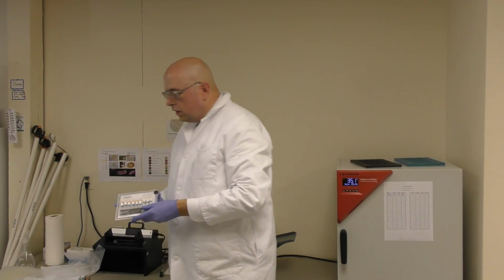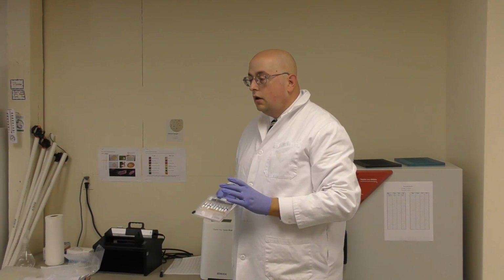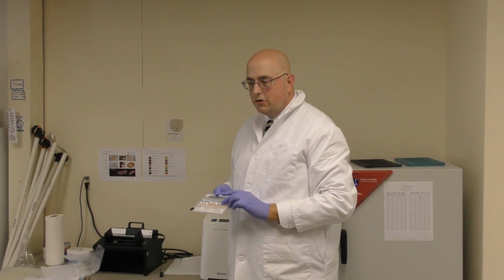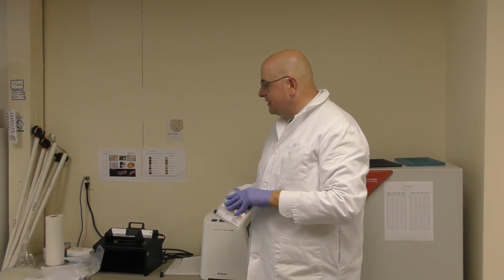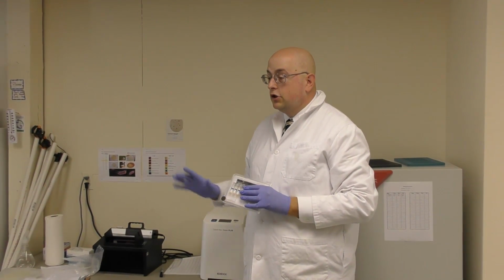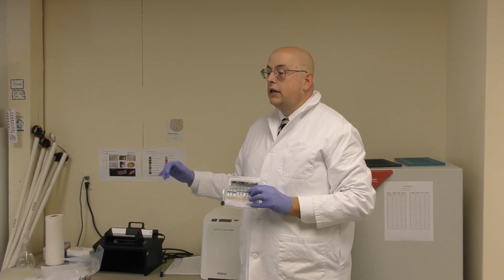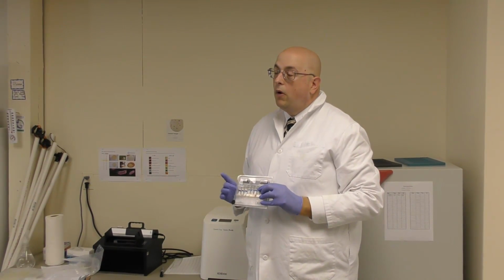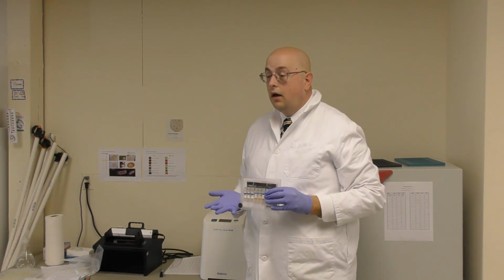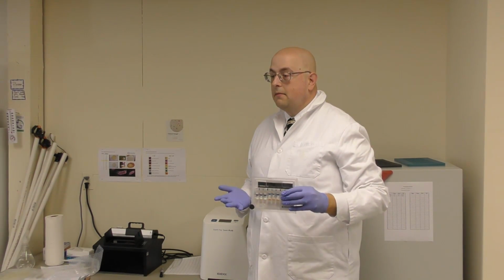The way the Quanti-Cult test works is you have in here 3 sets of vials. One is E. coli, one is Klebsiella, and the other one is Pseudomonas aeruginosa. So E. coli, you should be seeing that yellow color and it should fluoresce. The Klebsiella is a coliform bacteria, so you should only see the yellow color, no fluorescence. And the Pseudomonas, you should see no color and no fluorescence. Okay. And what this does is this ensures that the media you're using isn't contaminated, didn't come from the manufacturer contaminated, or that your technique didn't cause contamination to occur.